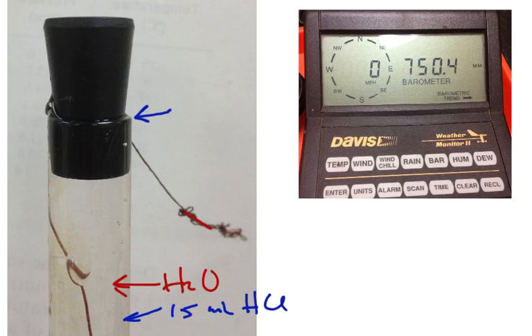You put in the stopper, and maybe something you can't really see right here is that there's a hole in the stopper, and that there'll be a little bubble of water that comes out the top. And that's important because you want the stopper to kind of hold the wire. So the wire is going down the edge here. It's kind of hard to see in this picture, so it's actually stuck back here somewhere. And you don't want any bubbles in your tube except for the bubbles that form from the hydrogen. So you want to make sure all the bubbles come out.